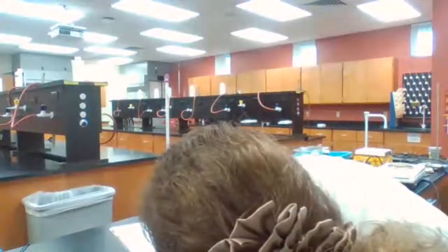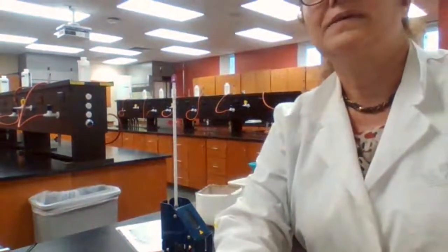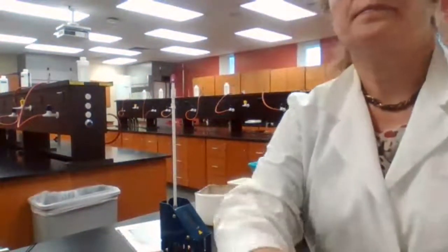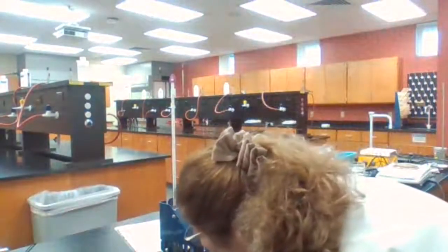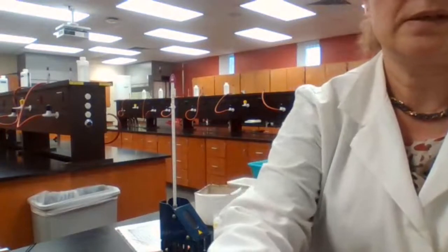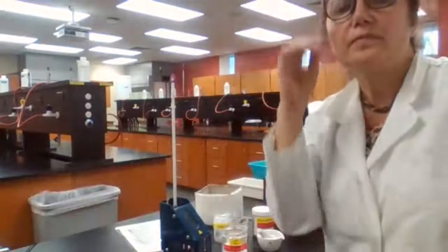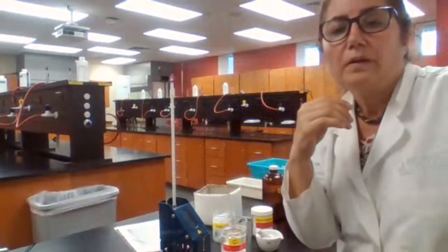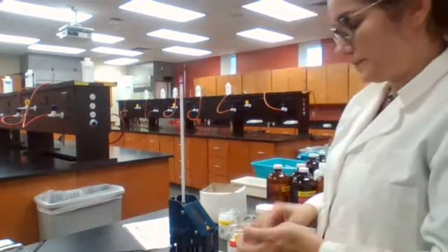Okay, this is starting at 78, please record it. 78. Okay, it went a little too high, so 78, and then it was going to 80, 82. Yes, the letter for the unknown is C.